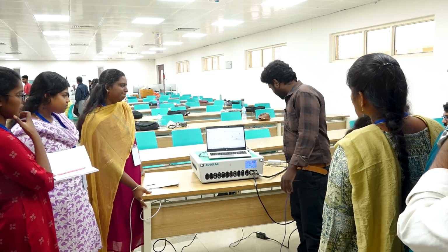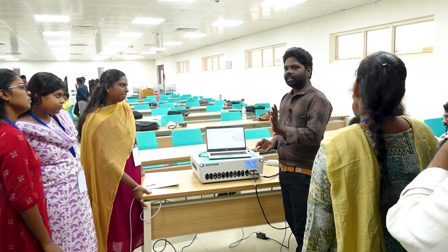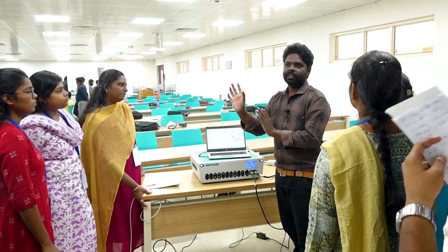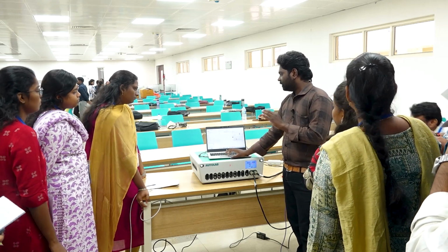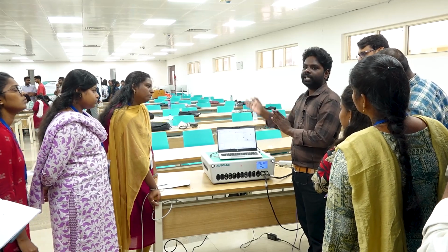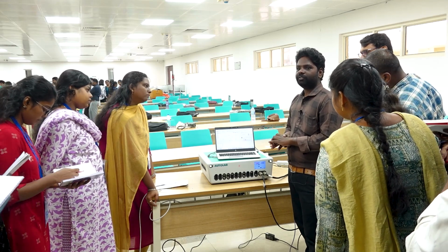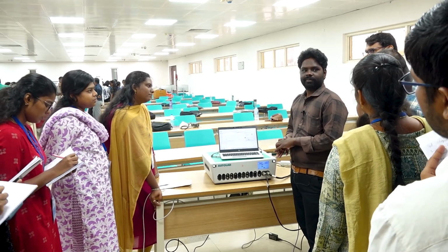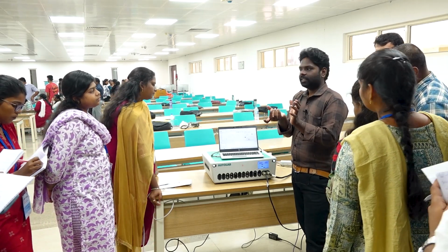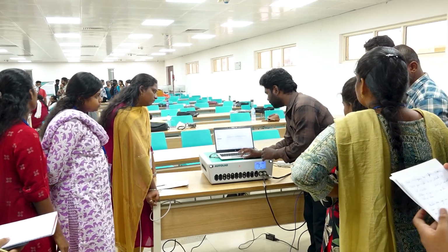Actually, in this test cell we don't have the option to simulate the diffusion properties, but we have one more data set here in which I will explain how the diffusion graph looks. Generally, after the semicircle, whenever you get a 45-degree line, that simply denotes Warburg, or diffusion. Warburg is the name; diffusion is the property. So Warburg, right? I will show you.